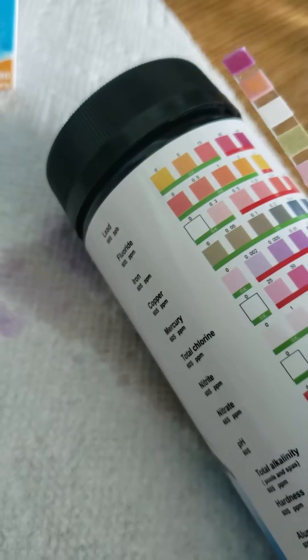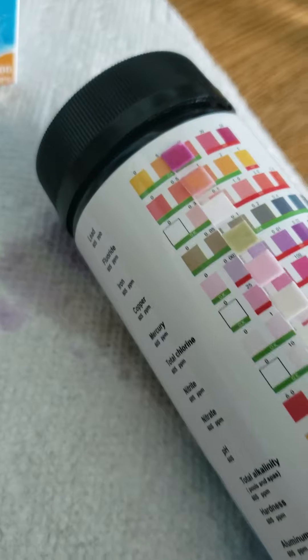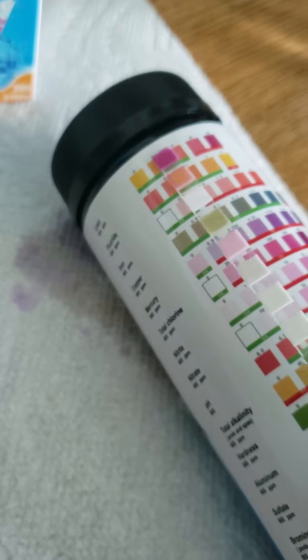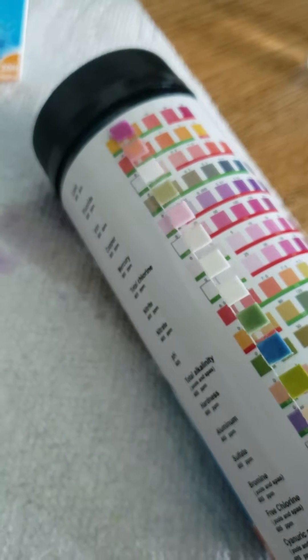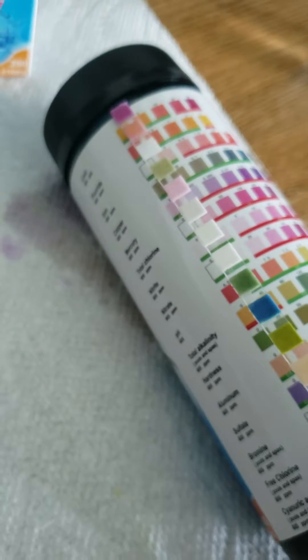The next one down is fluoride — looks like it's at about 0.5. The next one is iron — that's negative. Copper looks negative. Mercury looks negative. Total chlorine looks negative. Nitrite looks negative. Nitrate looks negative.